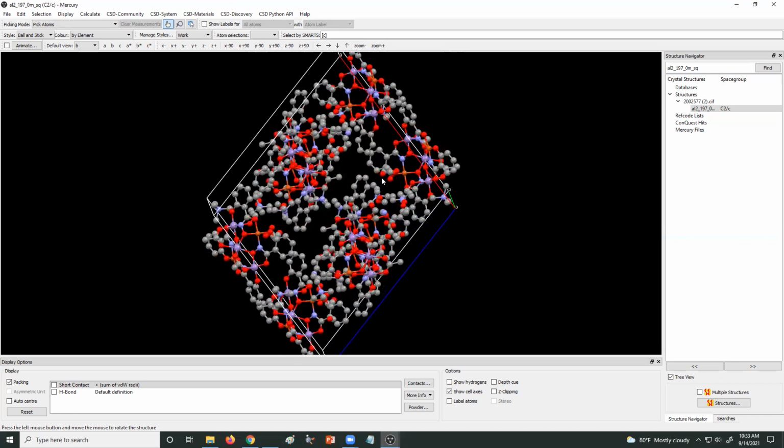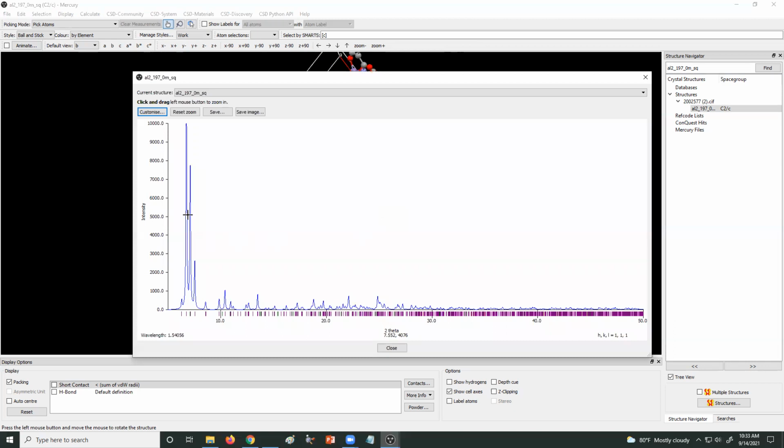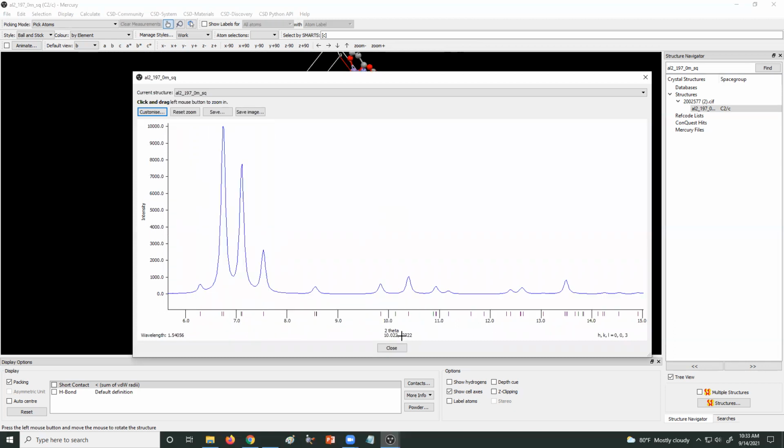As that crystal is rotated through the X-ray angle, you get diffraction, no diffraction, diffraction, no diffraction. So let me go back to the powder pattern one more time just to point this out. Let me zoom in on a part. That means that at this value of 2 theta, which is 10.391 degrees, so theta is half that, right? At this value of 2 theta, there happened to be planes of atoms at the right angle to allow diffraction to occur and give a constructive X-ray beam overlap. Notice that throughout all these other angles, none of the planes will allow diffraction of the X-rays.